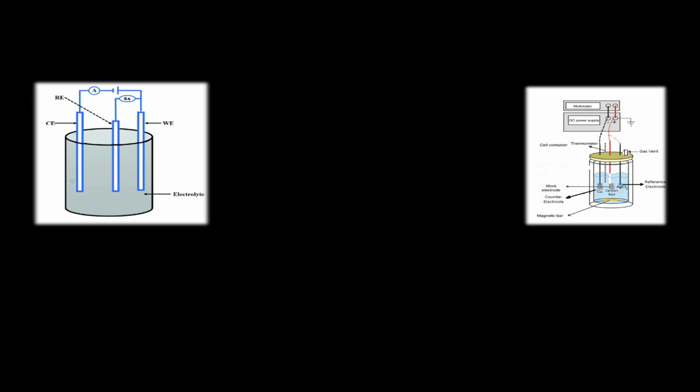Using a reference electrode allows for the precise control of the cell potential in respect to the working electrode. It is advantageous to ensure that the target element, that is, the element of interest, is deposited without unwanted side reactions. This not only enables total deposition, but allows for a quantitative determination, that is, how much was actually deposited. It not only allows for a stable voltage baseline, it compensates for the IR drop of the solution.